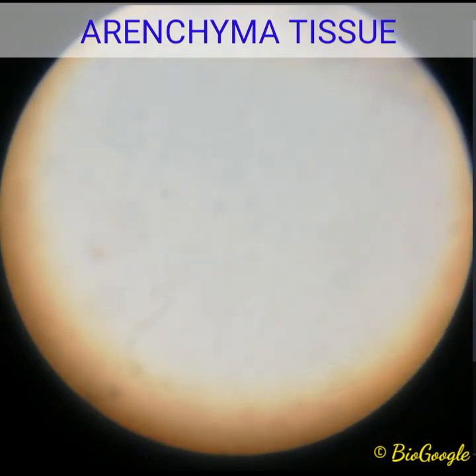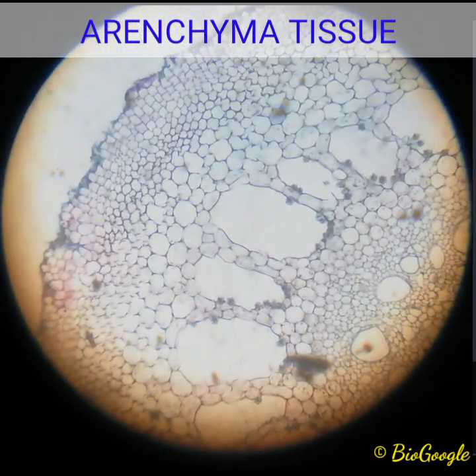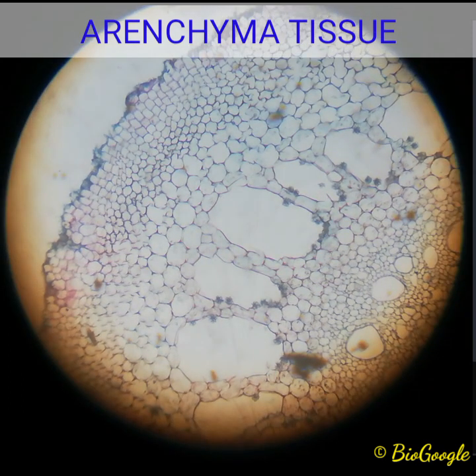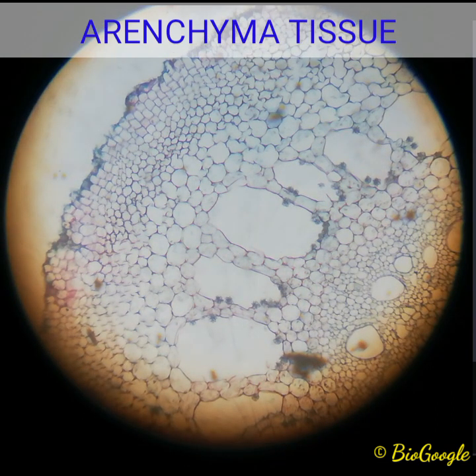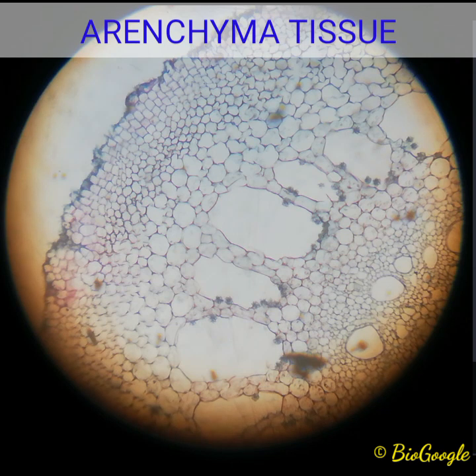Next is aerenchyma tissue, one of the parenchyma tissues that stores air spaces. Here you can clearly see the air gaps between the groups of cells. Aerenchyma is present in plants that grow in water — aquatic plants — especially those that require the property of buoyancy, meaning floating on the water surface. For example, the lotus plant whose leaves and flowers float on water, just because the plant has aerenchyma tissue in it.